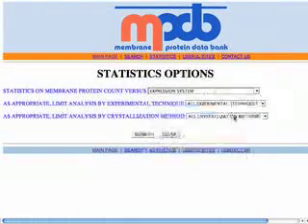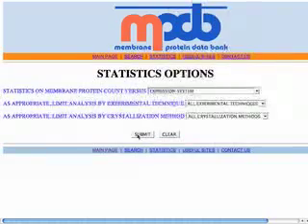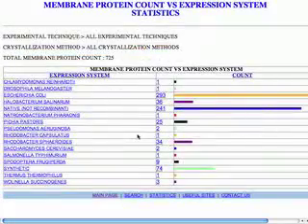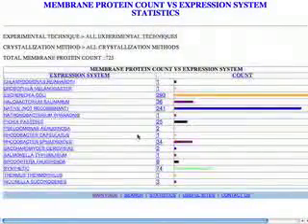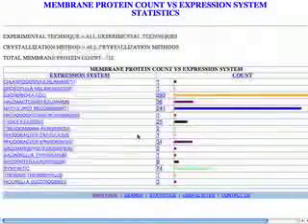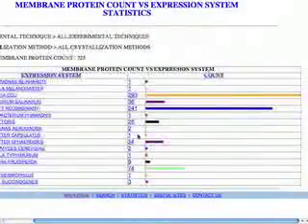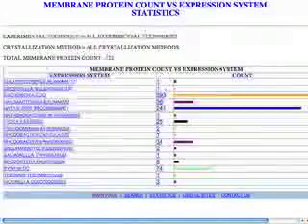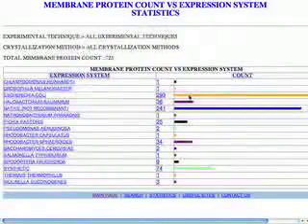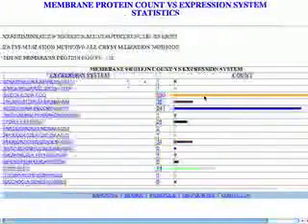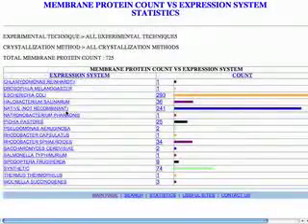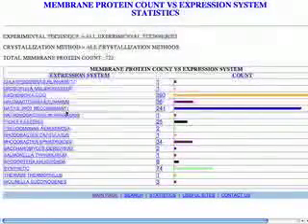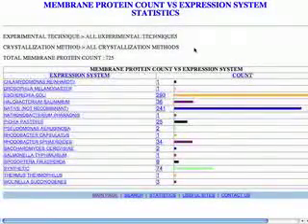Let's just look at the expression system. We click expression system and hit submit, and I basically get a very nice graph generated on the fly, which tells me that E. coli still remains the most popular expression system for membrane proteins, followed by native, which is basically getting at the protein from the organism itself.